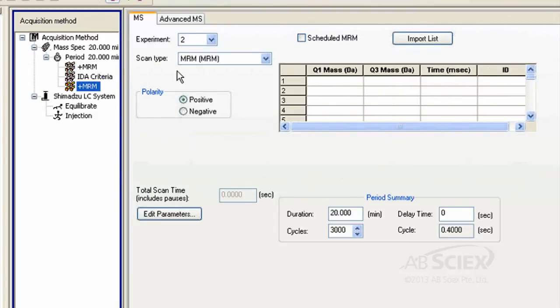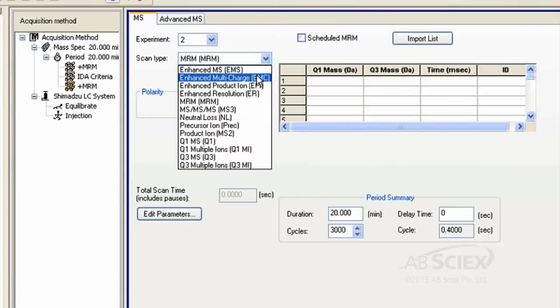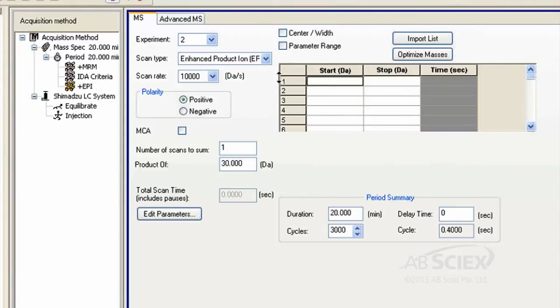Change the scan type to EPI, then specify your mass range and scan rate. Our recommended settings would be a mass range of 50 to 800 Daltons, which covers the full mass range of compounds in this method, and a scan rate of 10,000 Daltons per second to ensure fast data collection for best quality MS-MS spectra.